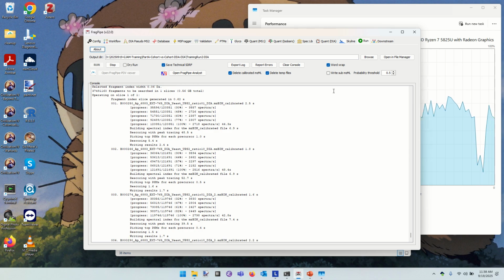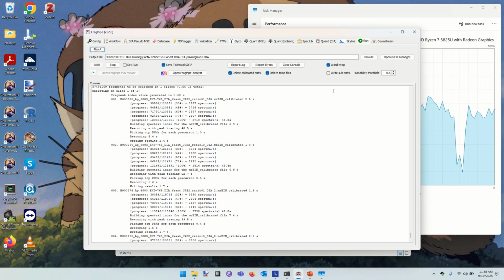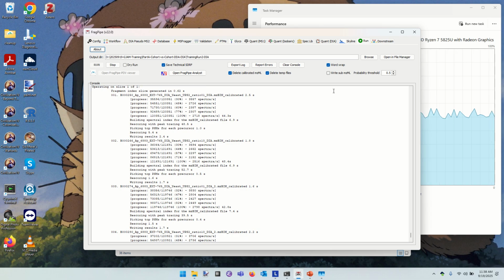But you do pay this awful cost. The identification time goes up. My computer needs... Huh? You don't get like a fingerprint spectrum. Right, yes. That you get from DDA. Yeah, the software is going to attempt to reconstruct that. The stuff that goes into the spectral library will be what fragment ions were measured for this peptide in the DIA scans, not just the raw DIA scans as they are.